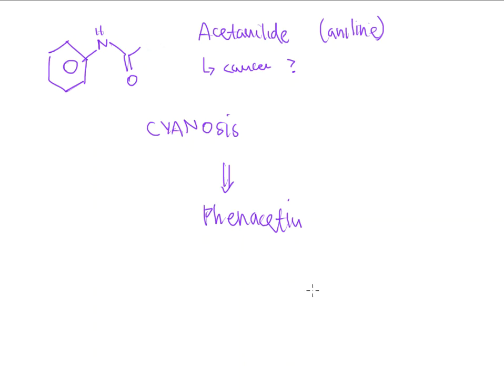And phenacetin, or acetanilide, is soluble in hot water, and the melting point is 114 degrees. All right? So phenacetin maybe will take on a little bit of different structure. It will take on some different properties, but we already see that acetanilide is soluble in hot water, and the melting point is a little bit lower. 114 is what we're finding out.